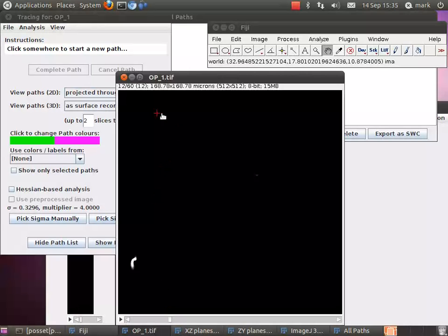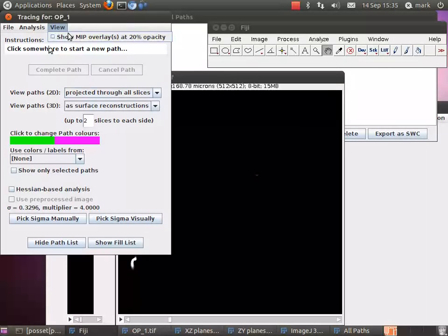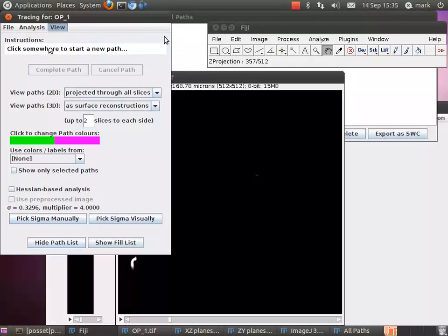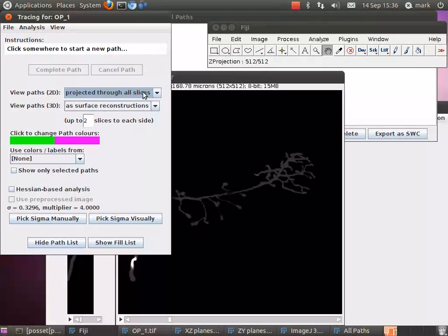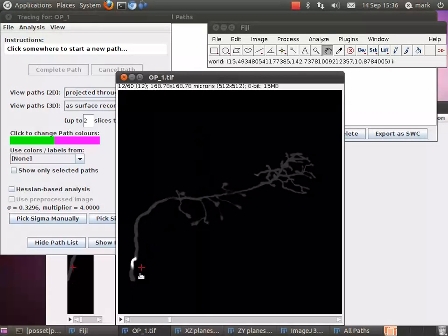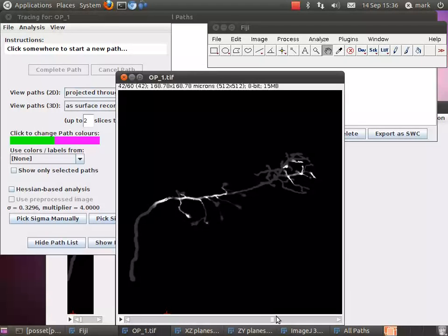So now there's an option in the View menu which you can turn on called Show MIP overlays at 20% capacity. MIP in this case stands for Maximum Intensity Projection. So if I turn that on, you should see that there is a projection of the entire structure which is being overlaid transparently over the image.